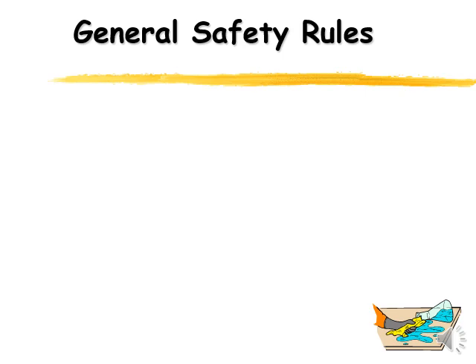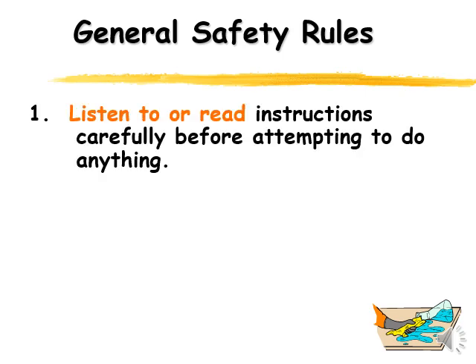Let's talk about some general safety rules. These are in no particular order. The first one is: make sure before you start, you listen to the instructions your teacher is going to give you and you read your instructions. We usually give you a lab sheet and say read the instructions, and we also tell you things to look out for and how to do the lab itself. So before you do any experiments, make sure you listen to or read instructions carefully before attempting to do anything.